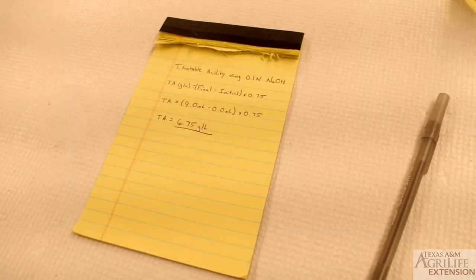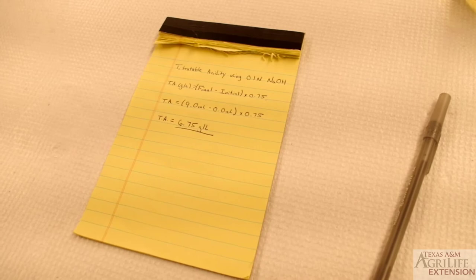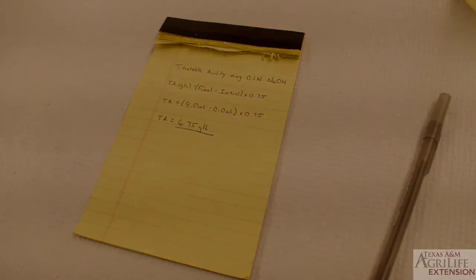After a quick calculation, we have our answer. We have a titratable acidity of 6.75 grams per liter.